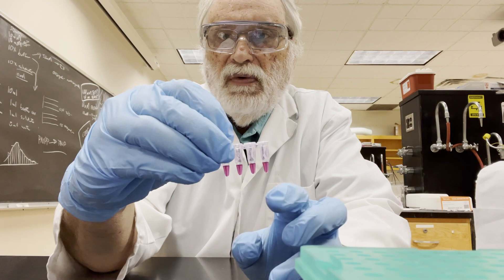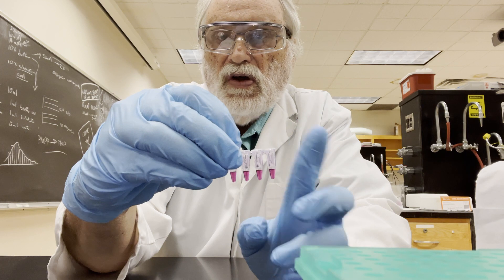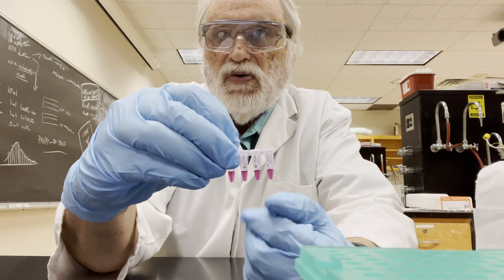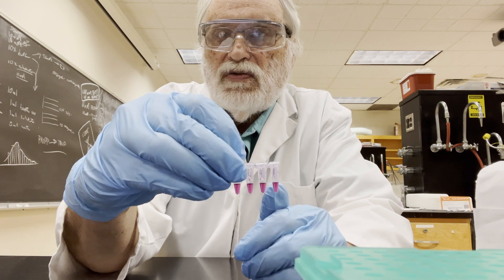And after we do the PCR reaction, we'll take 10 microliters out and run those on agarose gel to make sure that the PCR reaction worked and the DNA is worth purifying.